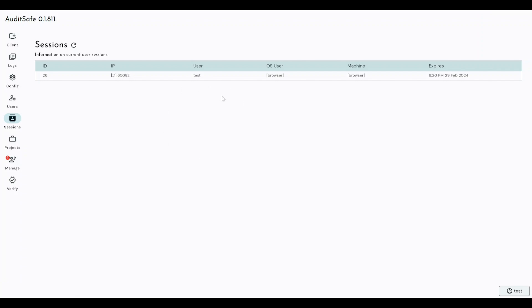So you can centrally manage everyone, all the users that are connected to the software, all through this browser, all centrally.